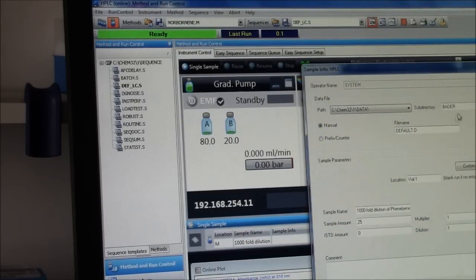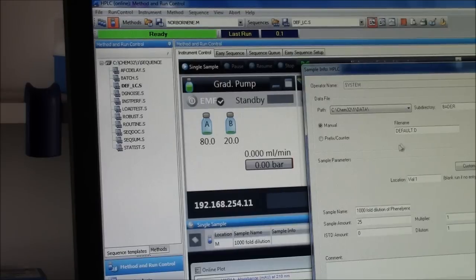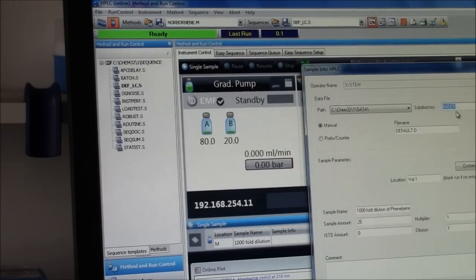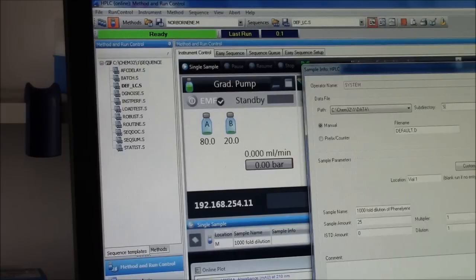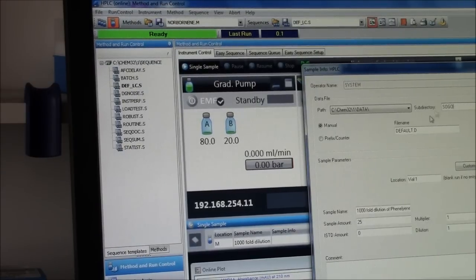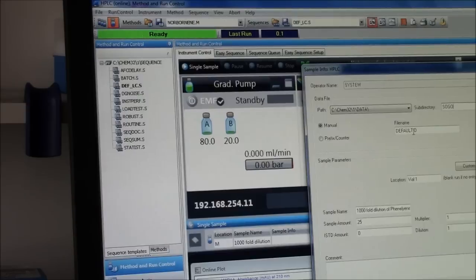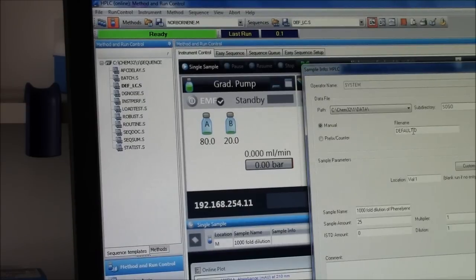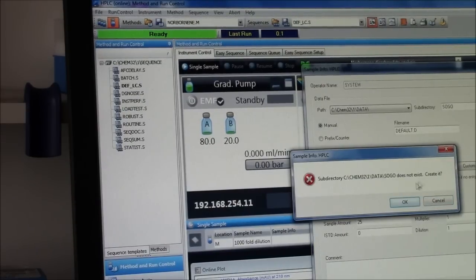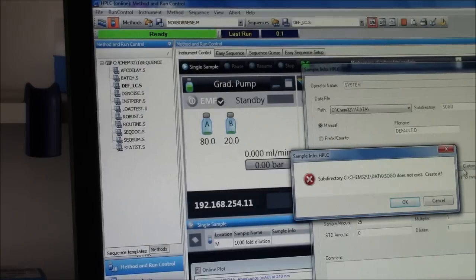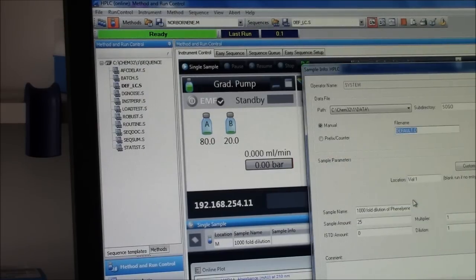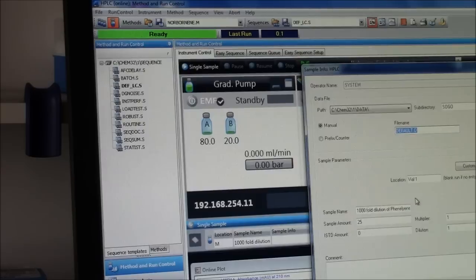I will tell it where to save my data and what to call it. Sub-directory here right now is Bader. If I say Sogo, that will save it in my personal folder. So I said sub-directory Sogo and it says that does not exist, create it. Yes, please. Now I have a folder for my personal data.